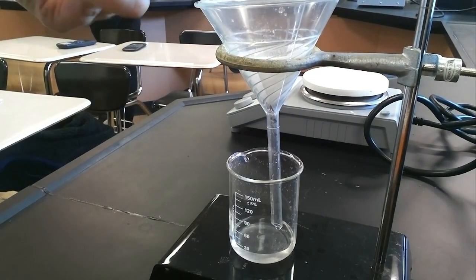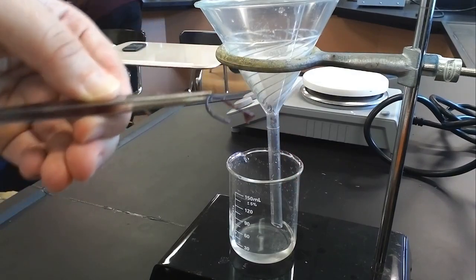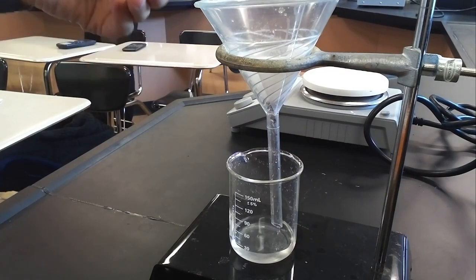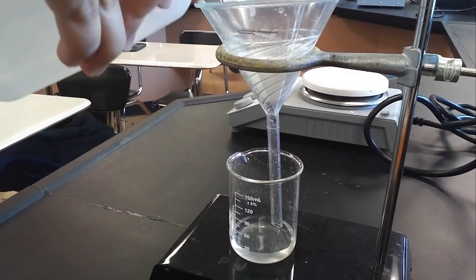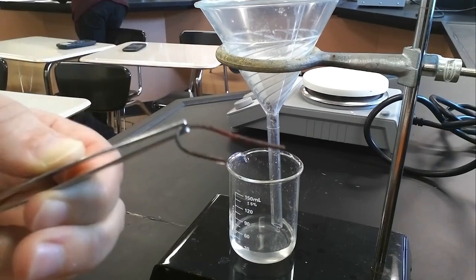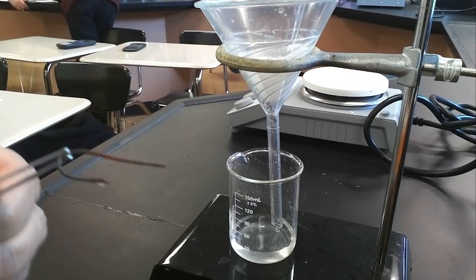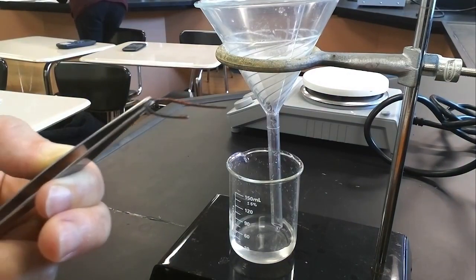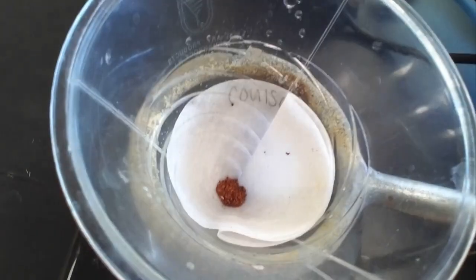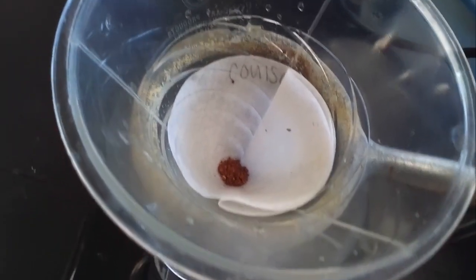I use tweezers to lift out the remaining aluminum wire, then rinse off the copper from the wire with a little bit more water, directing it into the filter paper. There is a tiny bit of copper still on the wire, but I dispose of the wire in the waste container — there is definitely still some unreacted aluminum. The water and clear liquid have all drained through, with a minimal amount of liquid remaining.